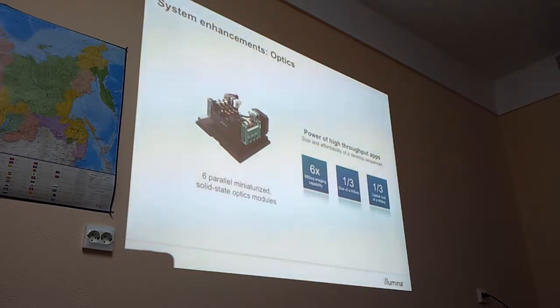So these are the 6 solid-state optic modules. I heard they are manufactured in Germany. The instrument itself is manufactured in Singapore, but this unit is in Germany.